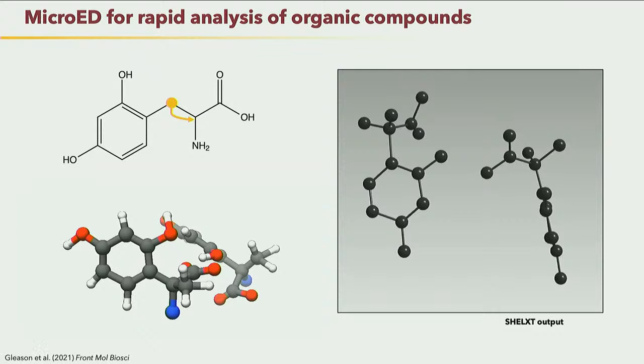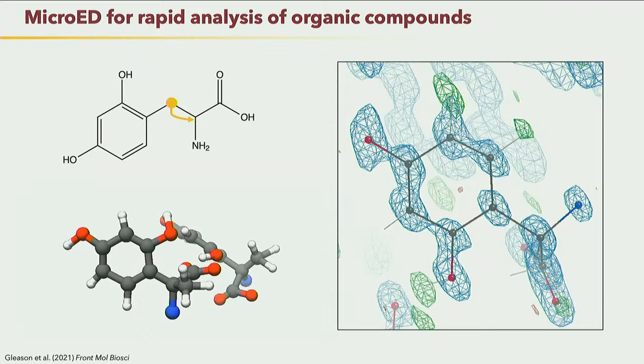So it basically saved them 2 weeks of figuring out what is going on, because every crystallographer knows, seeing is believing, right? They're going from NMR spectra, doing CD, doing all this stuff. Well, here, boom, here's the structure. Yeah, you've got something weird. And so that was really cool. 2 hours, that's all it took. And then there's some map. You can even see some nice density for hydrogens on there too.